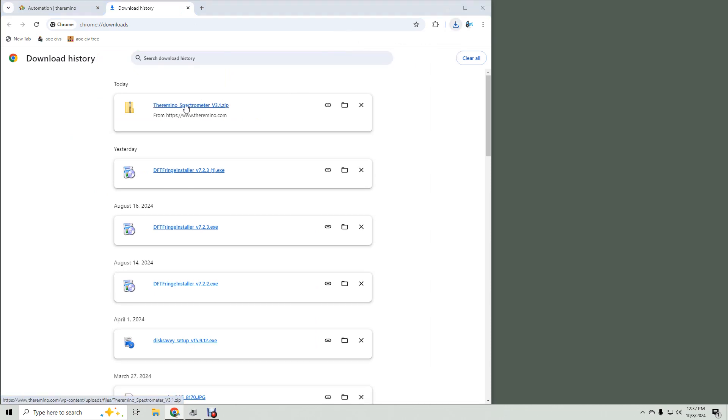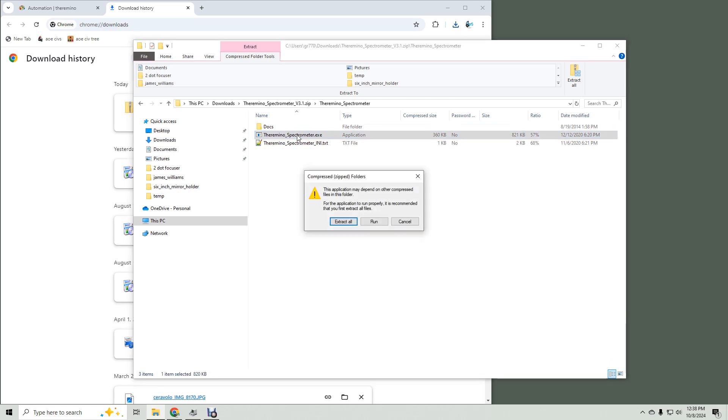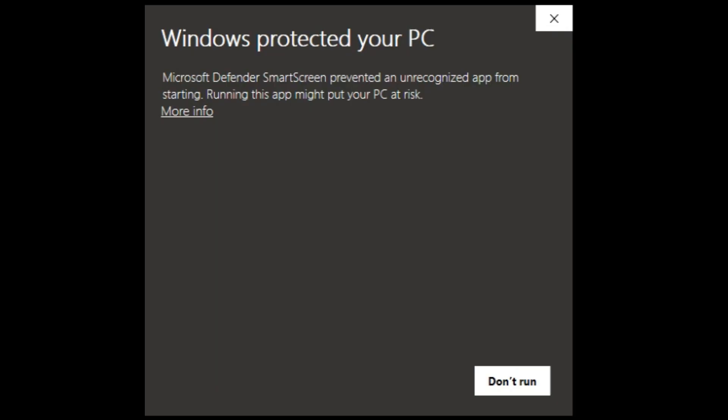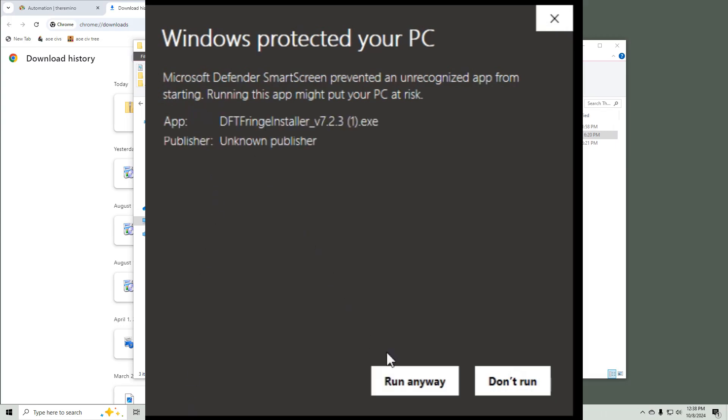Then when it's done, click the zip file to open it. Double-click the folder, then double-click the installer application. You might get a security warning screen — if you do, click 'More info,' then click 'Run anyway.'